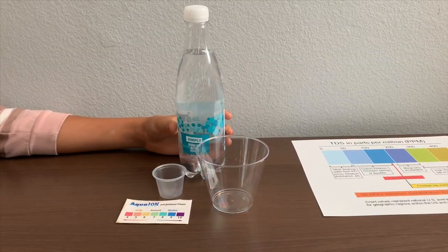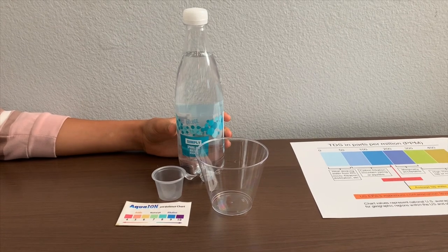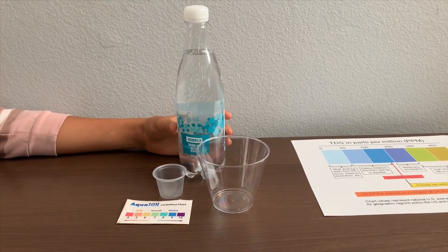This is Deluge Simply Sparkling Water, sourced from California. It costs $1.50. Let's test the TDS and pH levels.